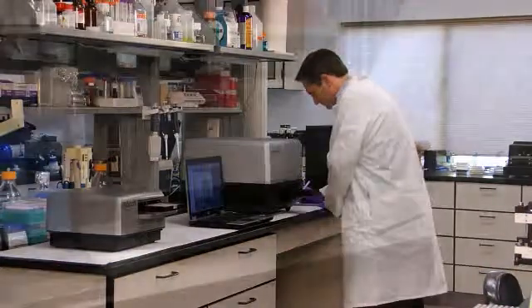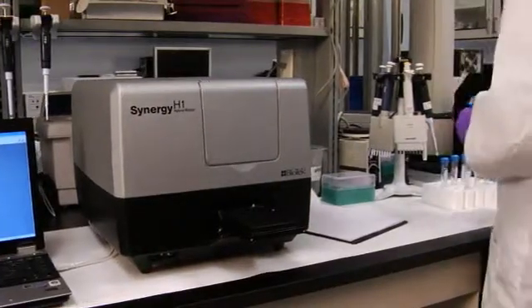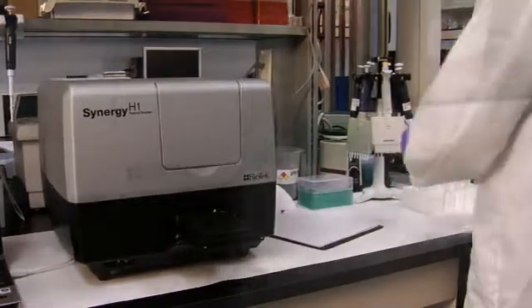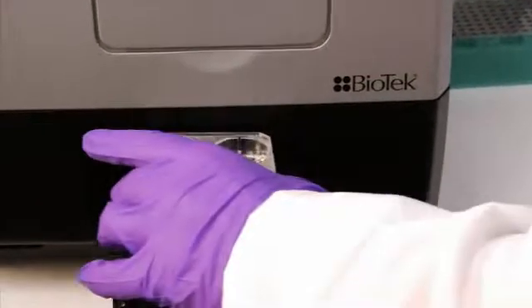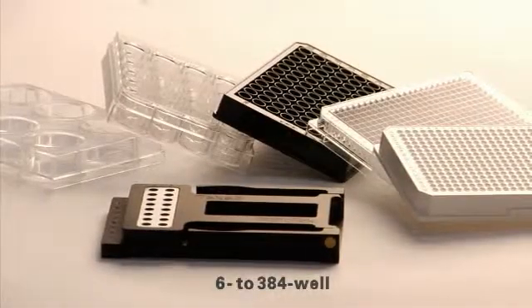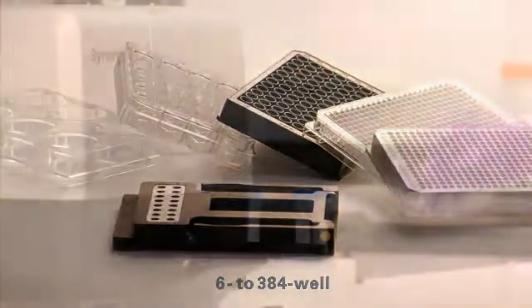This video presents BioTek's Synergy H1 and how its unique hybrid optical system addresses these key requirements. Synergy H1 is a multi-functional microplate reader designed to accommodate any plate type from 6 to 384 well densities using a variety of detection modes.